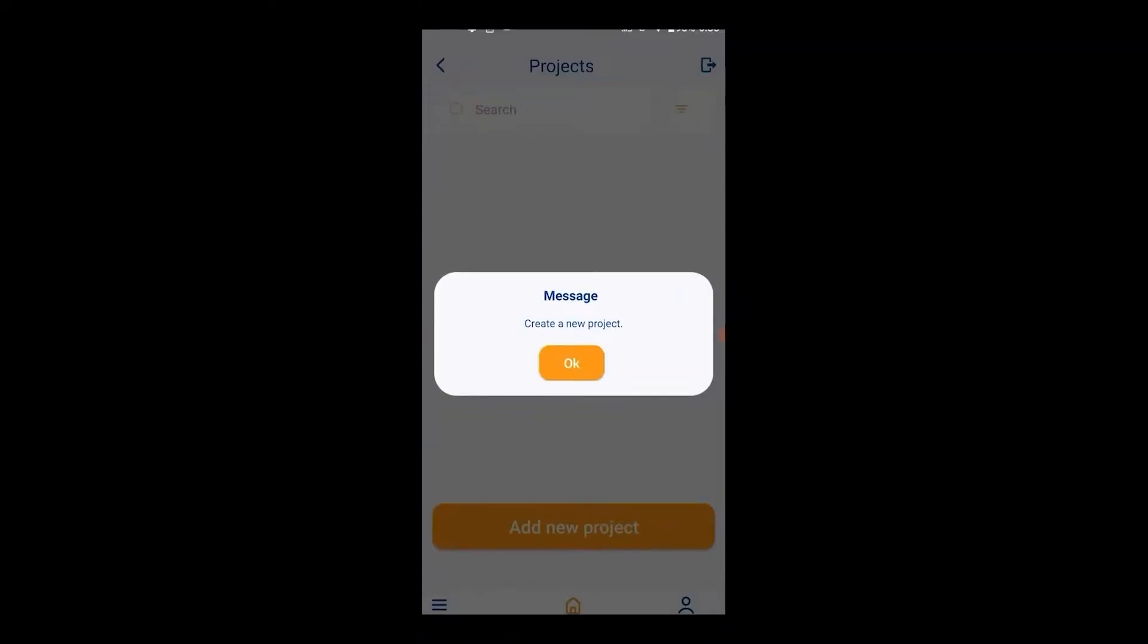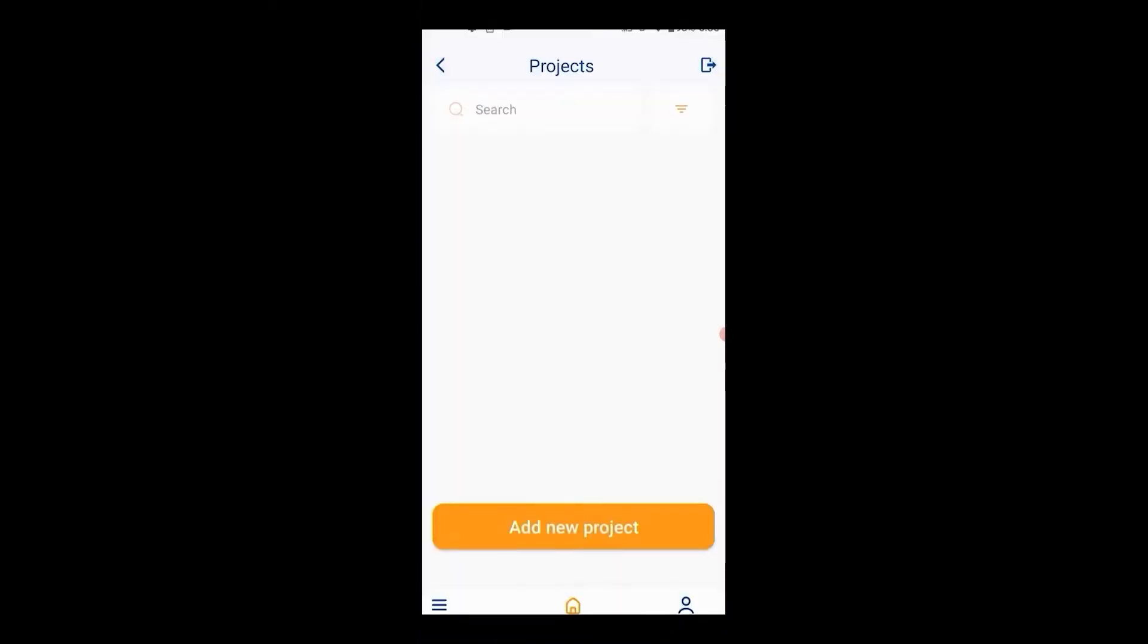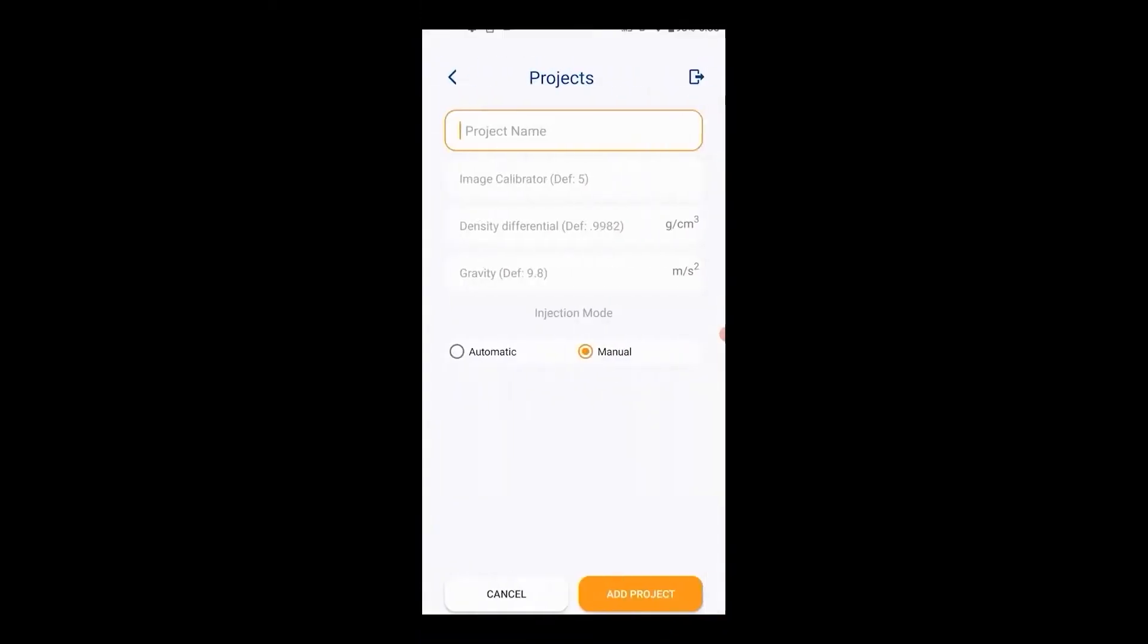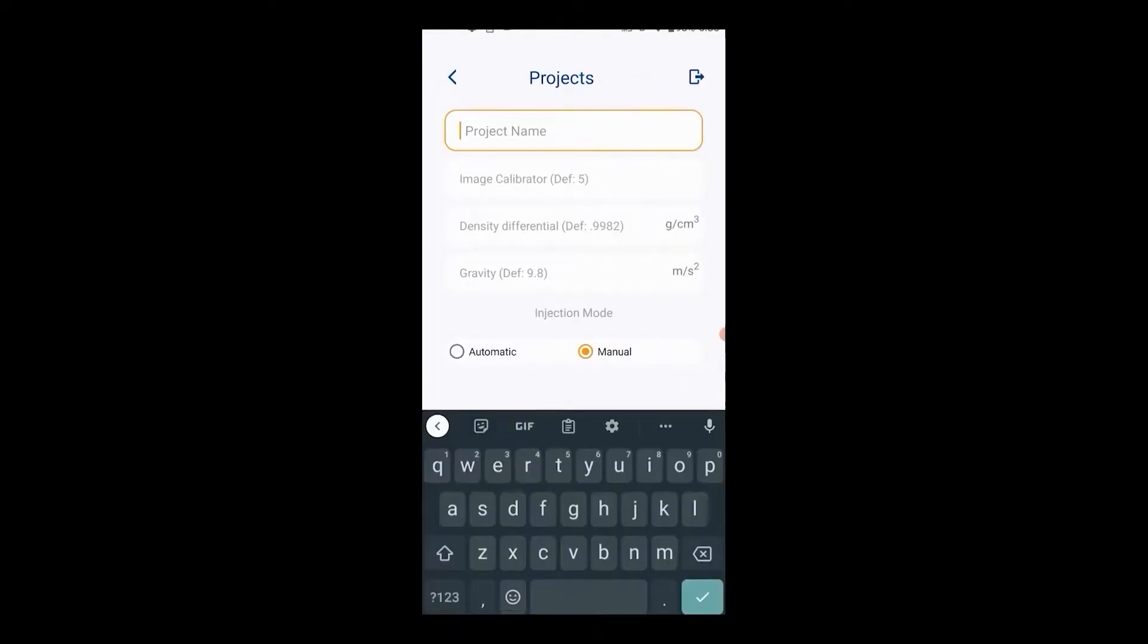After creating an account or signing in, create a project. This includes first the project name.